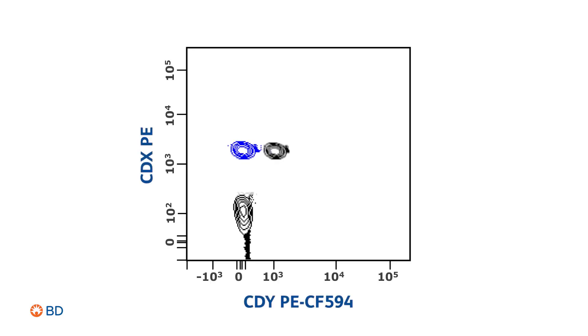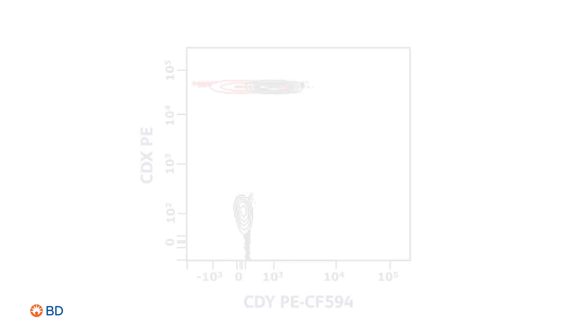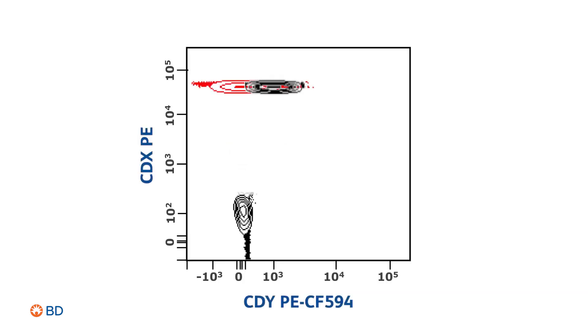The larger the spread, the more difficult it is to resolve dim populations from negative ones. In this example, the CDX expression is low, resulting in limited spread. Therefore, it is easy to resolve the CDX positive CDY dim populations shown in black. However, if the CDX expression is high, resulting in large spread, then it is difficult, if not impossible, to fully resolve the CDX bright CDY dim populations shown in black.